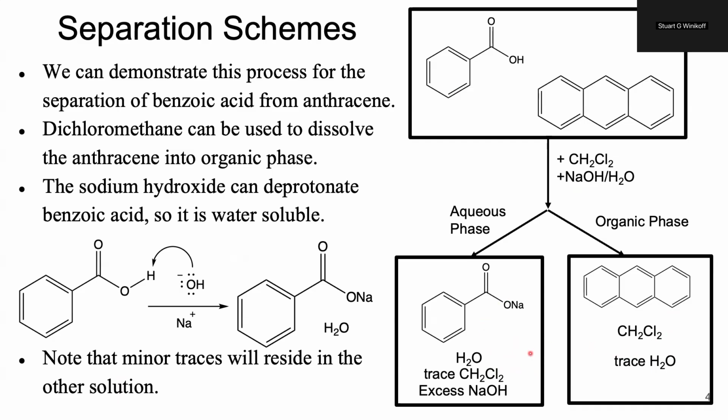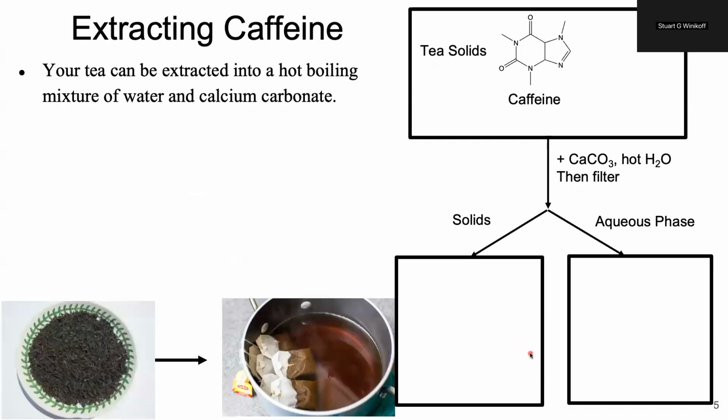So let's go ahead and see how this applies to what we're doing today with caffeine. I'm going to give you the general framework. I want you to go ahead and try and fill it in. The filled-in phase diagram will really be what to do next week as a take-home tracking, to make sure you were able to follow what we're doing at every step.